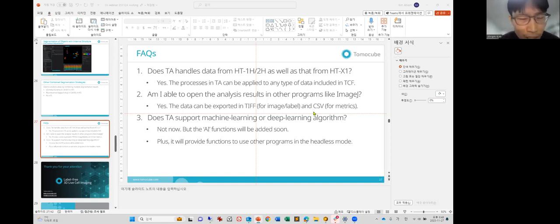Suchin Yadev asks, how should I approach the segmentation of nucleoli and quantify changes in nuclear refractive index when the threshold of certain drug-treated cells undergoes alteration? The most difficult segmentation targets at the moment are nucleus and nucleoli, because their characteristics are very special.